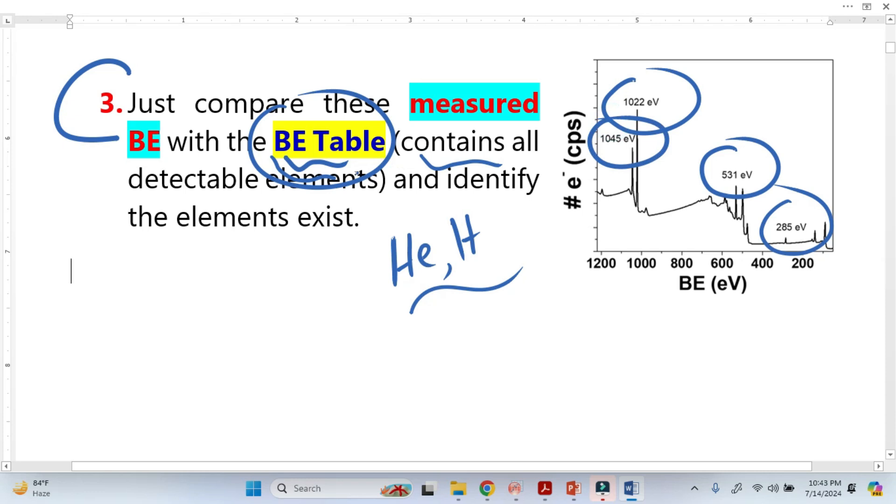Actually these values are from binding energy tables. Once we have these values, this means that in the binding energy tables these values belong to certain elements. So now we are ready to identify the elements.